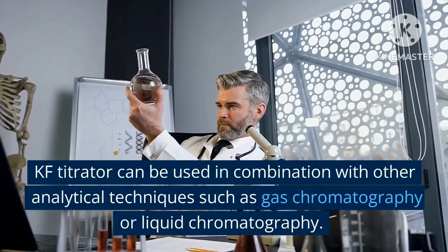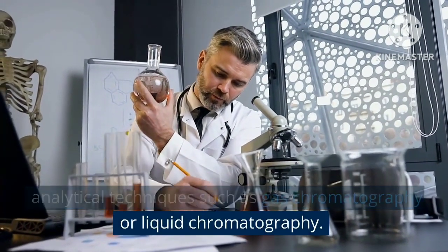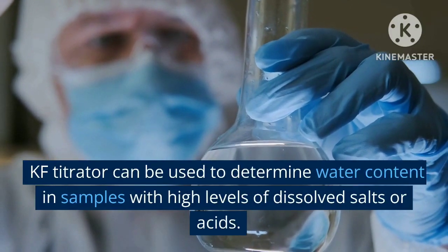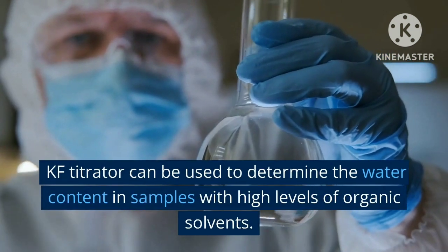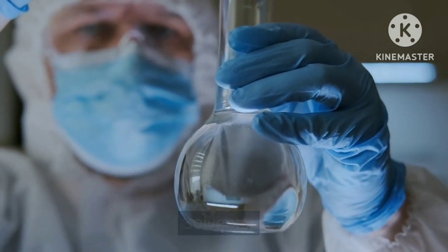KF titrator can be used in combination with other analytical techniques such as gas chromatography or liquid chromatography. KF titrator can be used to determine water content in samples with high levels of dissolved salts or acids. KF titrator can be used to determine the water content in samples with high levels of organic solvents.